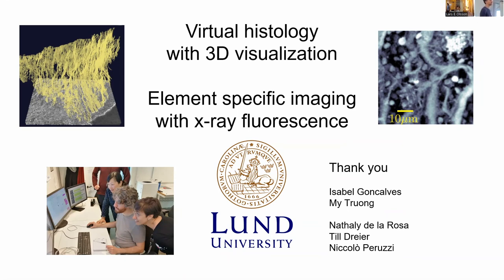But if you have a beamline, you also have the control of it, and this is why it's so important to have a beamline for life sciences. The idea was that you would have two end stations for two different types of resolution, which can accommodate live studies but also tissue-based studies. And then to complement it with the other beamlines that we have, NanoMAX and SoftiMAX, more into the cellular length scales, so that you can really look at this whole length space.